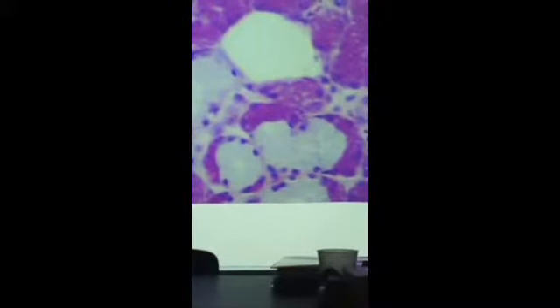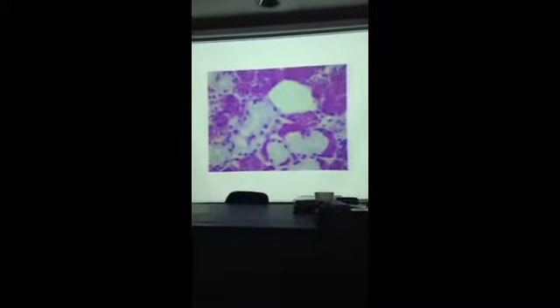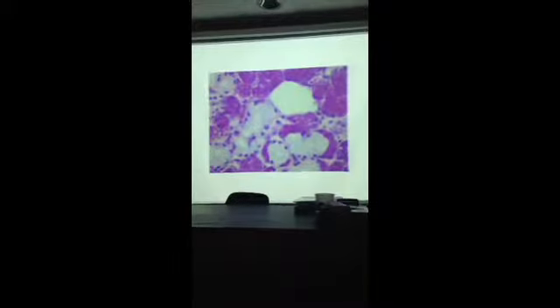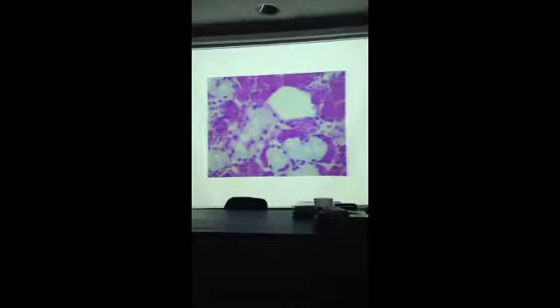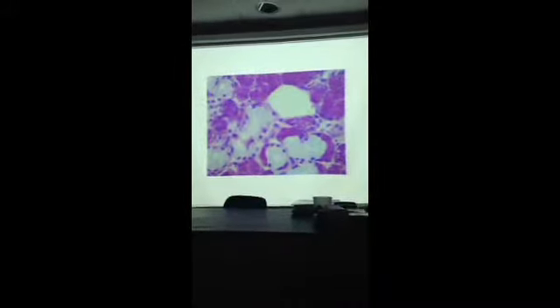Okay? Any other questions on this? These are things you'll be able to pick out. So it shouldn't be a shock if I put a pointer on this type of cell and ask what it is, or a blood vessel, or a salivary gland duct and ask you what it is. Okay?